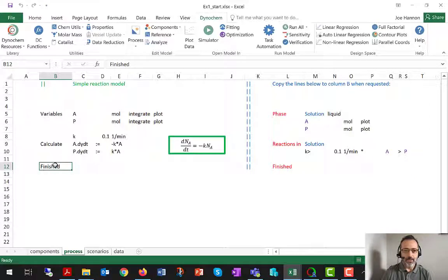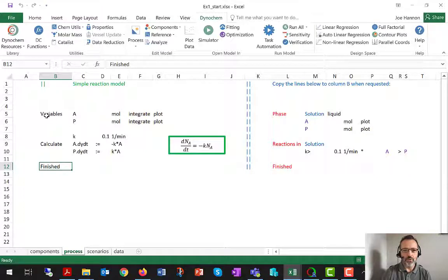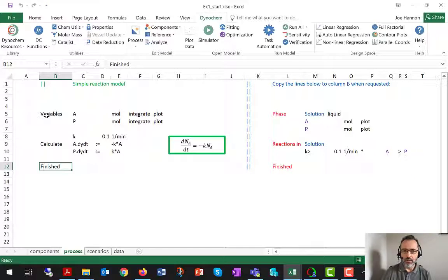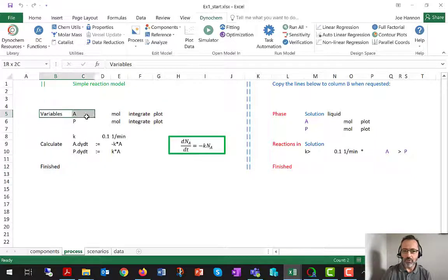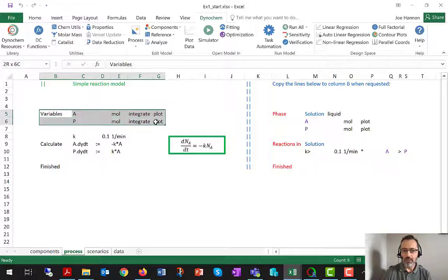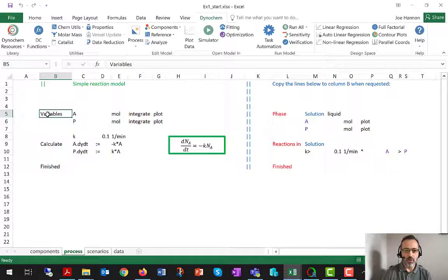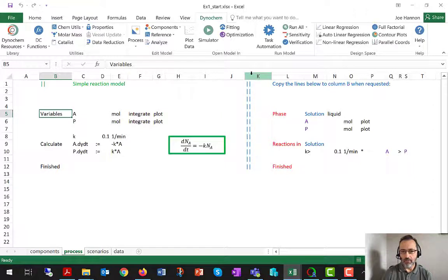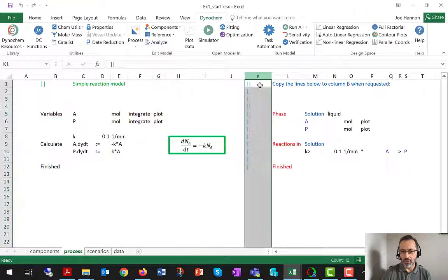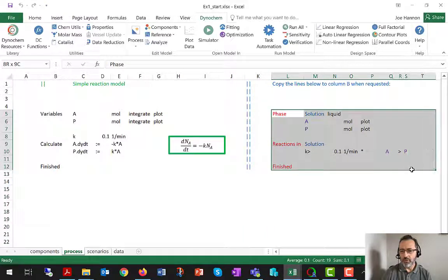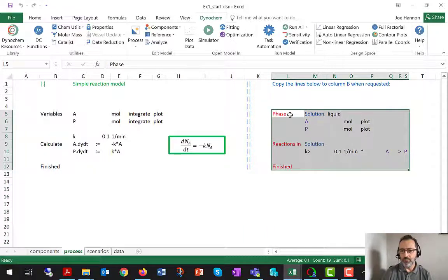And I just want to show you now that it is also possible for power users in particular to build Dynachem models that consist entirely of user-defined variables and calculate statements. So what I'm showing you here right now is a first-order reaction model. I've got the conventional Dynachem version on the right, so that's got the usual colorations.